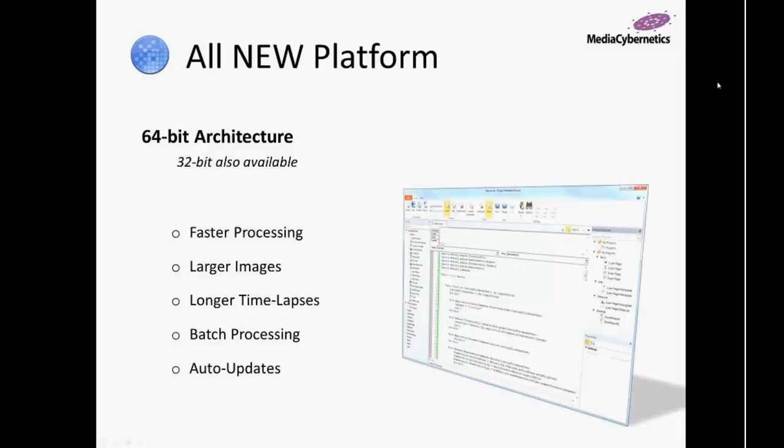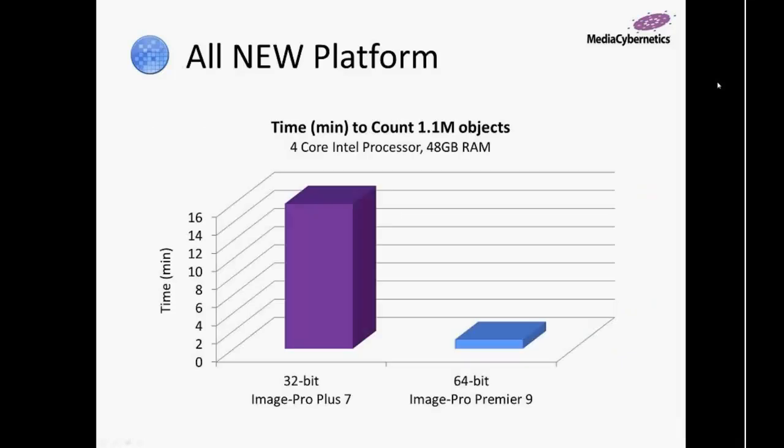At the same time, we're able to then download the latest and greatest versions when they do become available. We now have auto updates baked right inside the product. If you have an internet connection, you can simply look for these updates or even have the option selected to notify you when an upgrade is available.